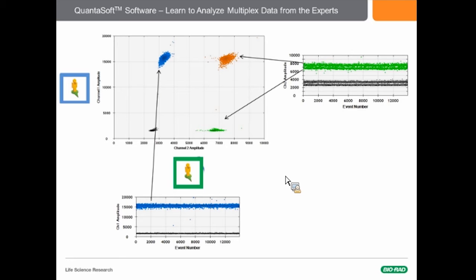This double banding pattern is the result of viewing two-dimensional data in one dimension. In other words, it is as if you were looking at a 2D graph from the edge, where one dimension is visible and the other is not. In this case, the orange cluster and the green cluster are slightly offset in the 2D view, whereas the blue and the orange are not.